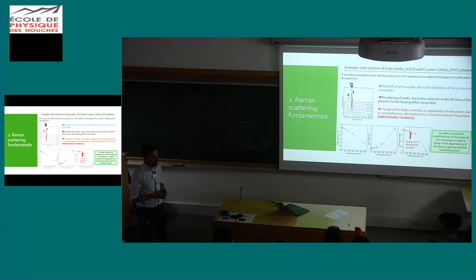But one more question. For how long did you put the laser that heats up this sample this much? Like you have this Raman shape from the original position. Normally, a Raman measurement takes between a few seconds to 2-3 minutes. But I mean, for how long was the laser on the sample that it really makes this shift? Yeah, absolutely. Normally we take one spectrum every minute, 3 spectra, and then we make the average of these 3. So 1 minute is enough to have this kind of effect.